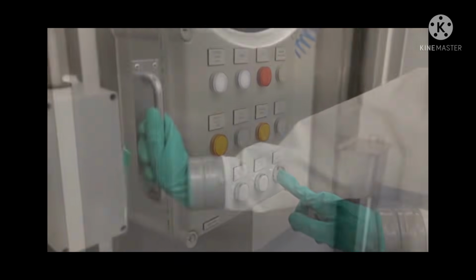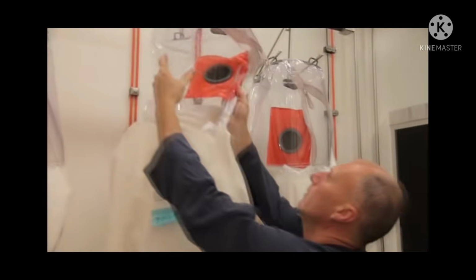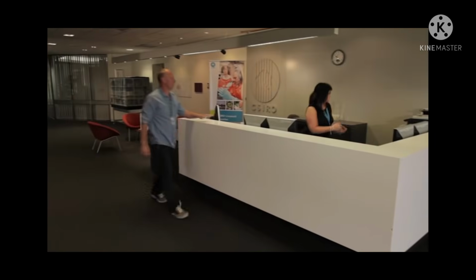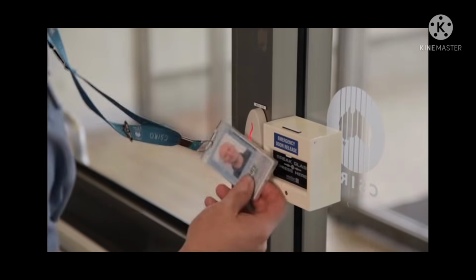As part of this biocontainment procedure, all staff leaving the laboratory must complete a 7-minute chemical wash before removing and leaving behind their suit and laboratory clothes. They must then shower out through an airlock. The shower process is then repeated in order to exit the secure area. Once outside the laboratory, staff must not have contact with livestock animals for 7 days.